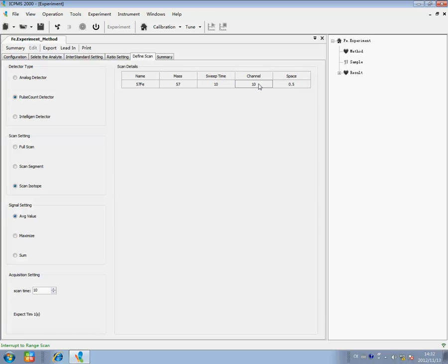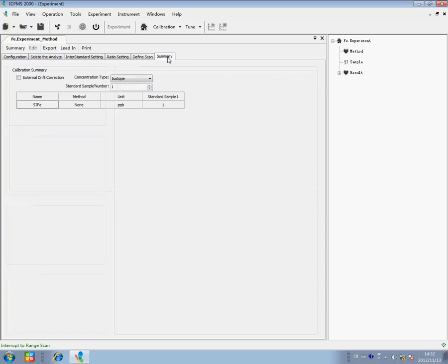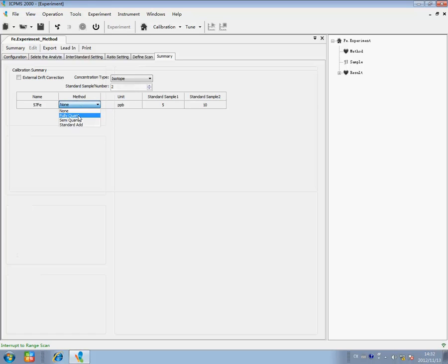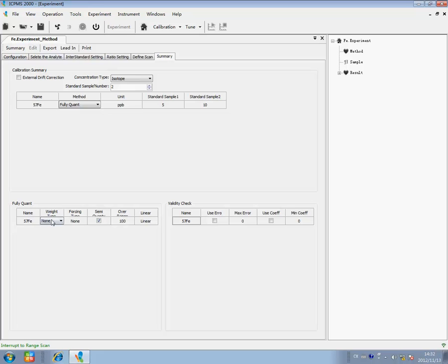Click Summary. Enter the number of standard samples, set the concentration type, choose the test method, winning type and forcing type. For sample setting, set the number of samples, test times, revise sample name, and choose blank sample.